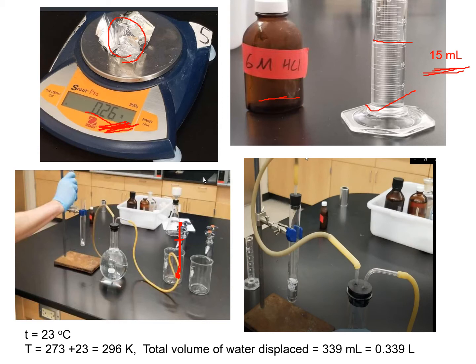All right. So this is how we do the experiment. This is a round bottom flask here, and it is fitted with the cork and different pipes. One pipe goes like this, and this pipe is connected to the beaker here, and this pipe here is connected to this reaction vessel. This is the reaction vessel. So what you do is you put aluminum foil inside this test tube, and then you put this 15 ml of the hydrochloric acid here, and you immediately close the top of this test tube with the help of the cork and the tube.